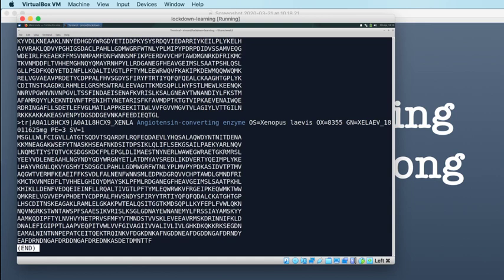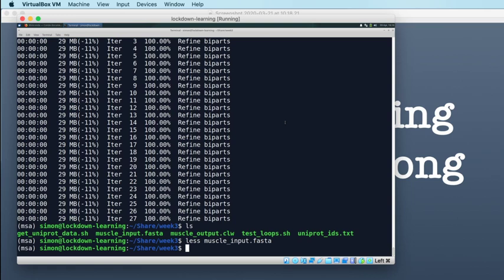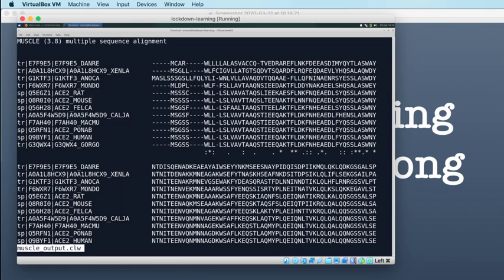So our alignment now should be slightly more cohesive. Rather than having one sequence which has a huge number of gaps in and doesn't really align very well at all, like we did yesterday, we should now have a much more cohesive alignment where things make a lot more sense.